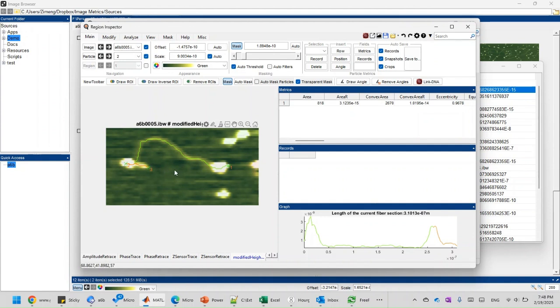The second way is to manually trace from point to point, one by one. To do that, without selecting the molecule, you first just double click the first anchor point. For example, here, let me first double click that. And that's my first point. Now you see there's only one point here. I'm going to add my points one by one along the trace. I move here, double click that, and move here, double click that, and finally move to my end, double click that.